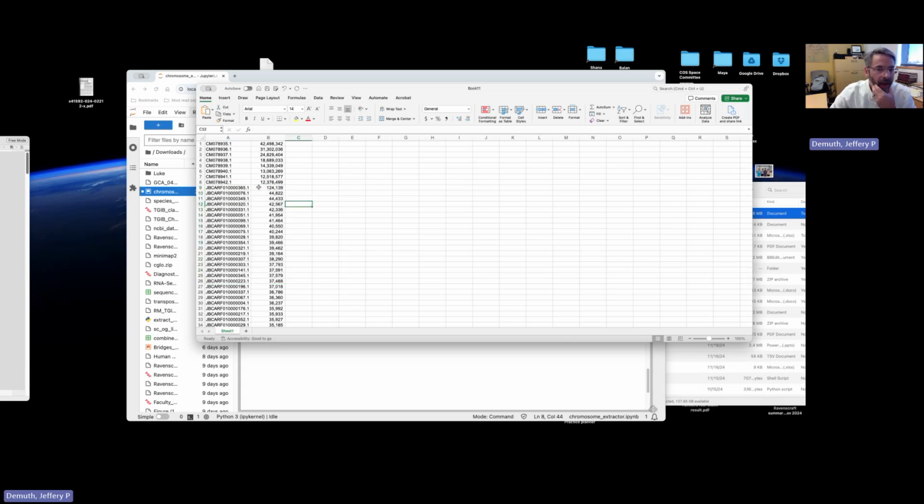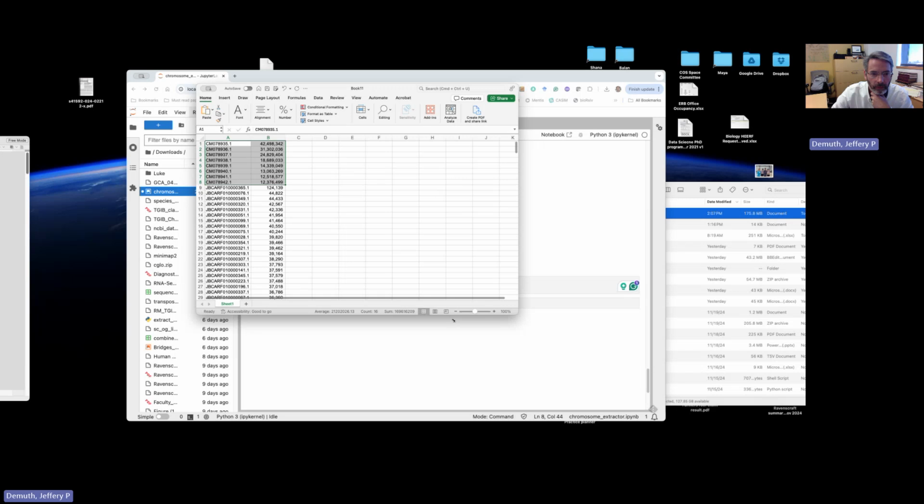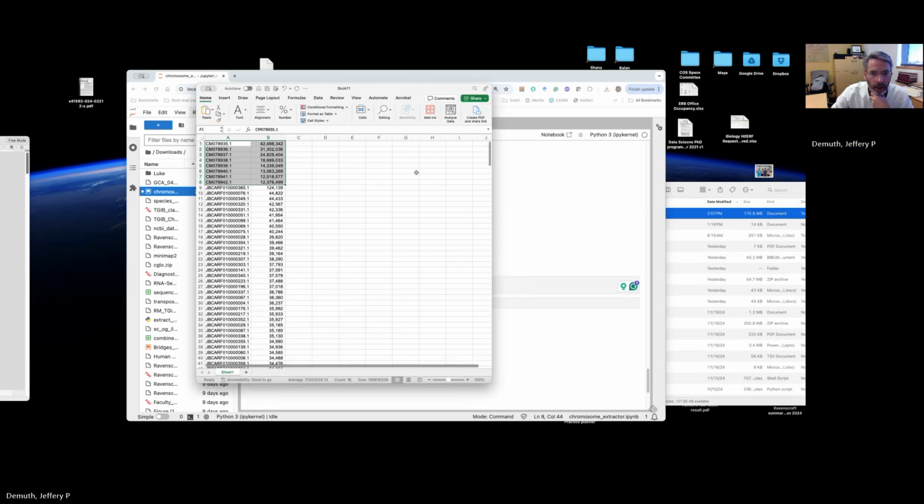Some of the genomes might have as clean a break here between what are chromosome scale and what are smaller unassembled scaffolds or unassigned scaffolds. We don't know which chromosome any of this stuff belongs to. So we are just going to keep these top 8. This file I would save, and then that's going to be one of the uploads. That is the first deliverable right there. I just generated the first deliverable.